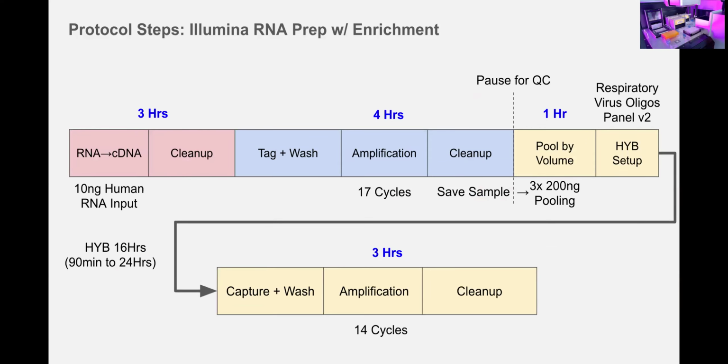So this is my approach to how I put this protocol on our robot. Since this is such a long and complex protocol, it depends on what your goal is for automating this. Mine was to automate this so it is, as much as I can, hands-off. So I didn't have to touch the robot, I didn't have to add any additional labware, and I didn't have to make any manual moves.